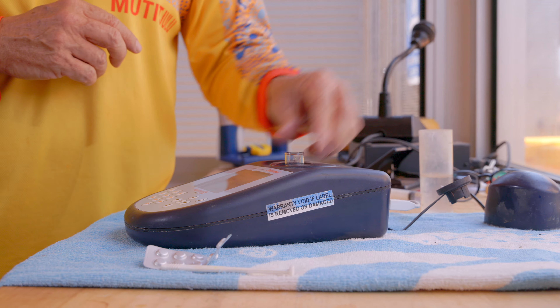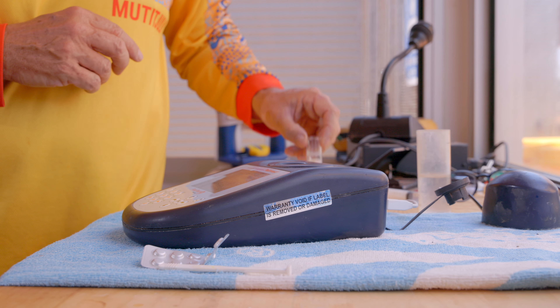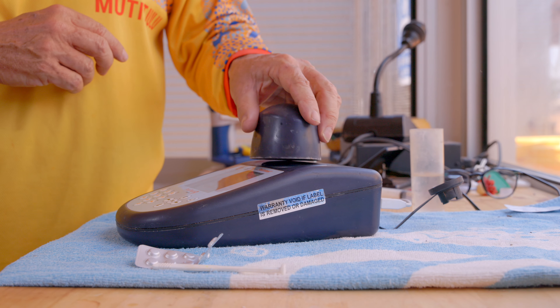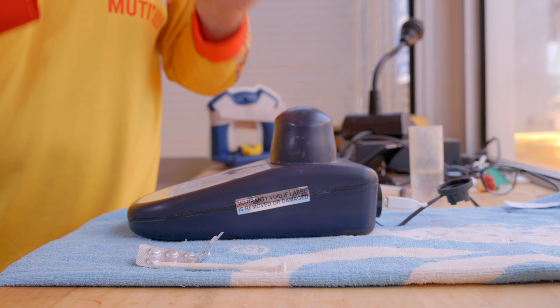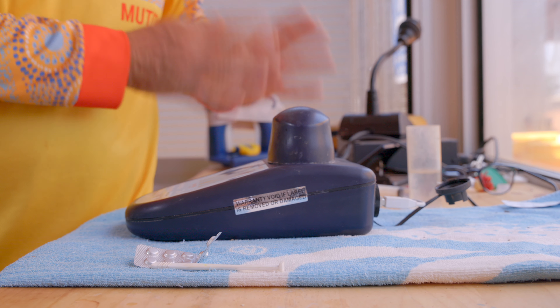So all that's left now is to pack the equipment away. We remove our test tube, put the lid back on, turn the equipment off, and then pack away our tablets and wash out the test tubes.